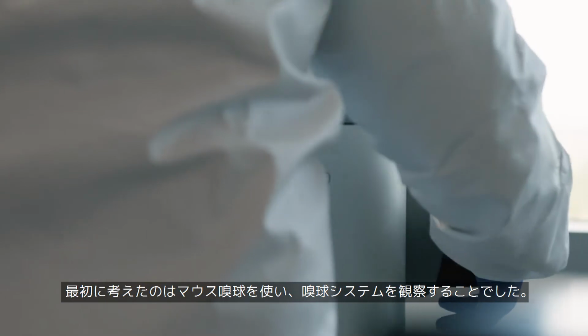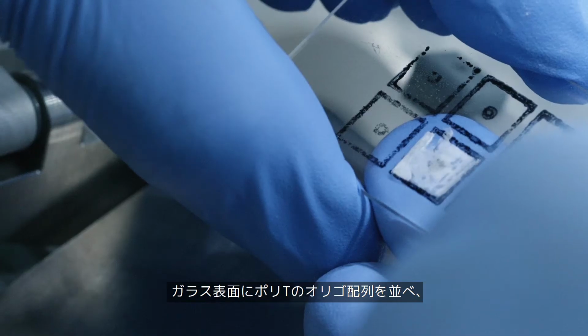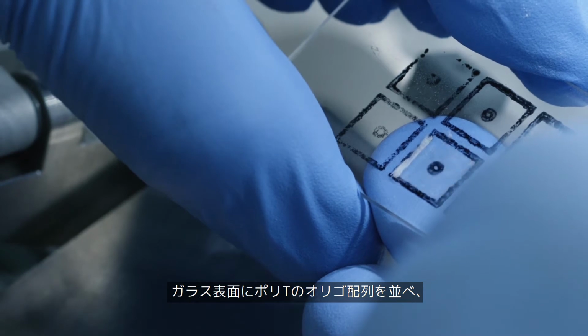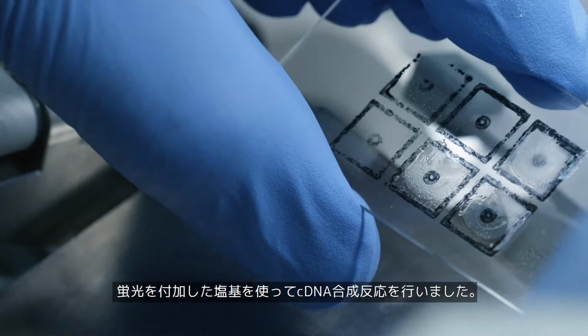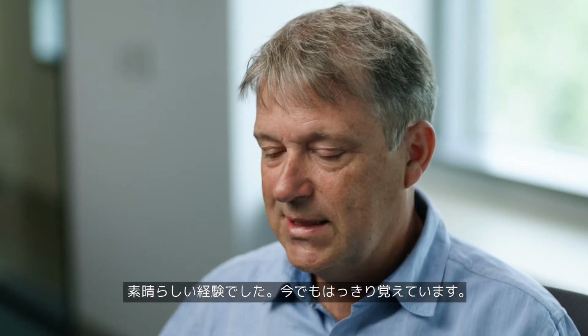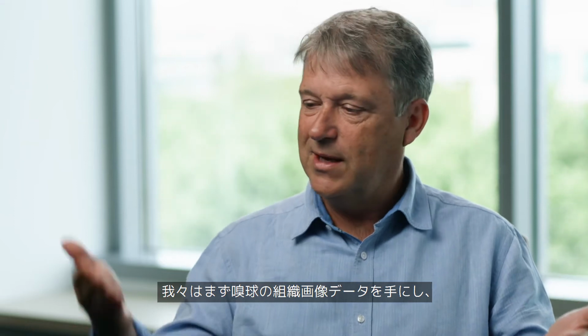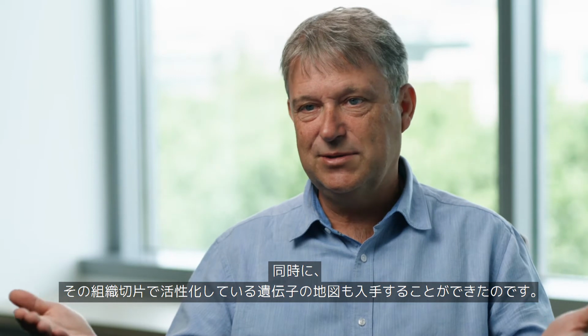We were looking at the olfactory system, the olfactory bulb in mouse. Put that on glass surfaces that only has a poly-T oligonucleotide. And then we did a copying reaction, a cDNA synthesis with fluorescent nucleotides. It was remarkable. I still remember this very strongly because suddenly we had the histology image of the olfactory system, and on the other side we had the print of the genes being active in that tissue section.